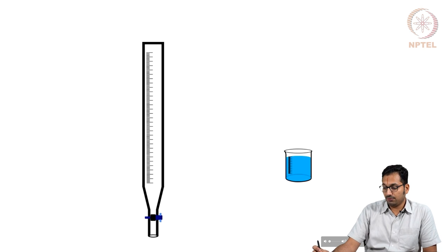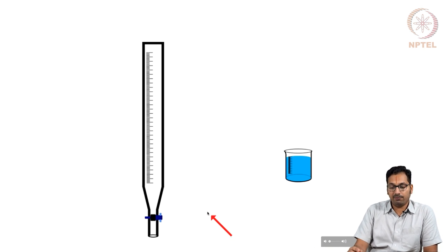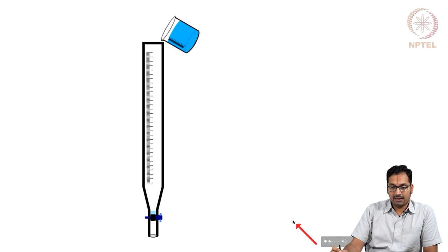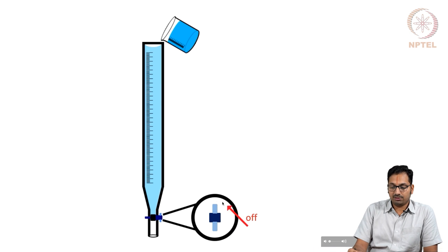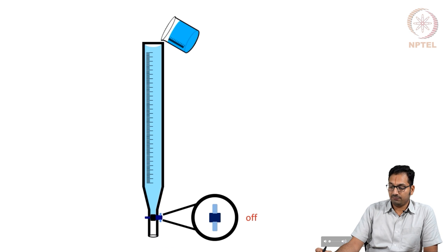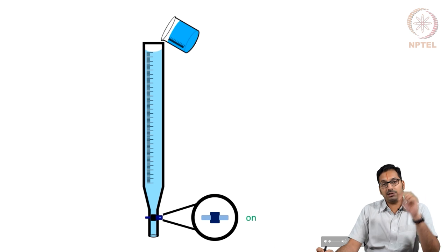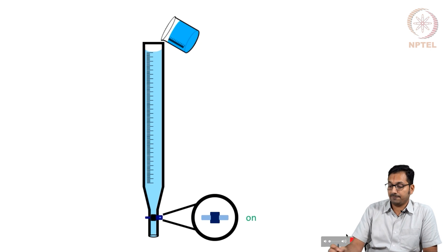Now let us take a quick look at how this experiment will be performed. You are looking at a burette here where the distilled water is carefully added. Ensure that the burette is open so as to fill the bottom portion of it, which will ensure that no systematic errors come into place. If you are not filling this part, you will definitely introduce a certain constant error across each of your measurements.